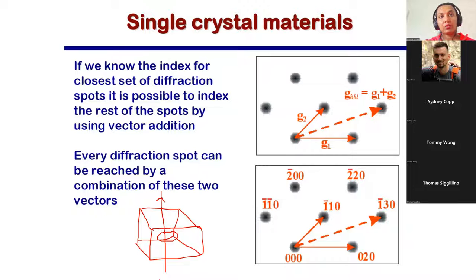Now, ideally I'm trying to tilt my sample. This is your condition here, X, this is your Y, and this is your Z, for example. You are trying to tilt your sample, which contains the dislocation loop, along these directions. So in one way, with the same crystal, you can look into this direction.